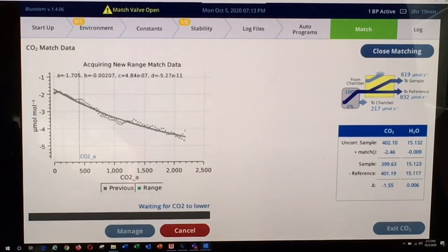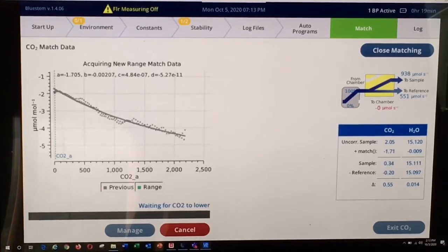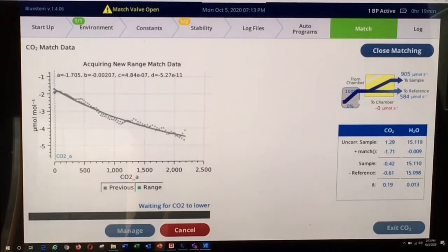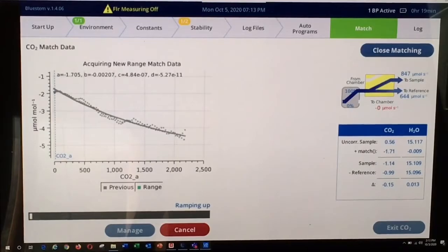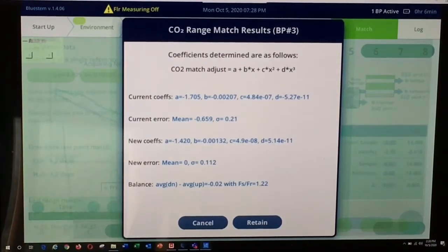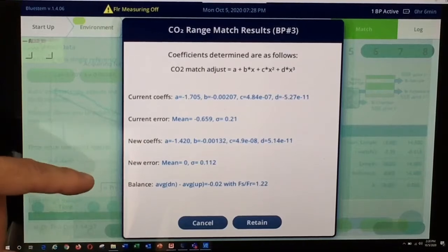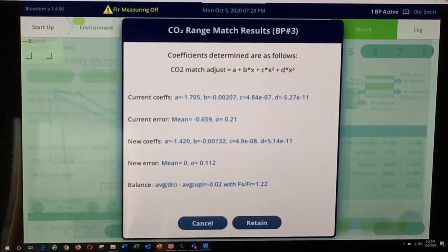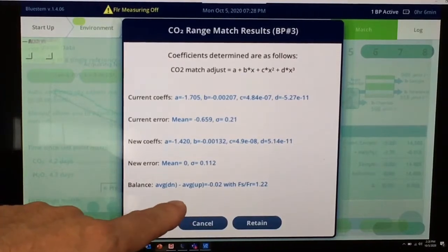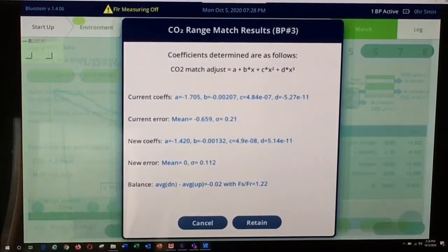The instrument then starts to conduct the range match. CO2 is first lowered in the IRGA, and then you will start to see new green dots appear on the screen as data is collected for the range match function. After the range match has been completed, the screen will display the current coefficients for the polynomial range match and the new coefficients for the range match just completed. It will also give you basic stats about the mean and standard deviation, as well as the balance between the average going down and up as the concentration ramps up and back down.